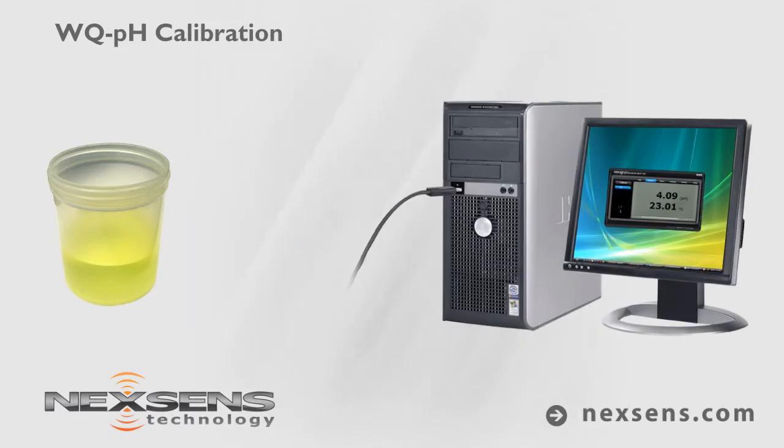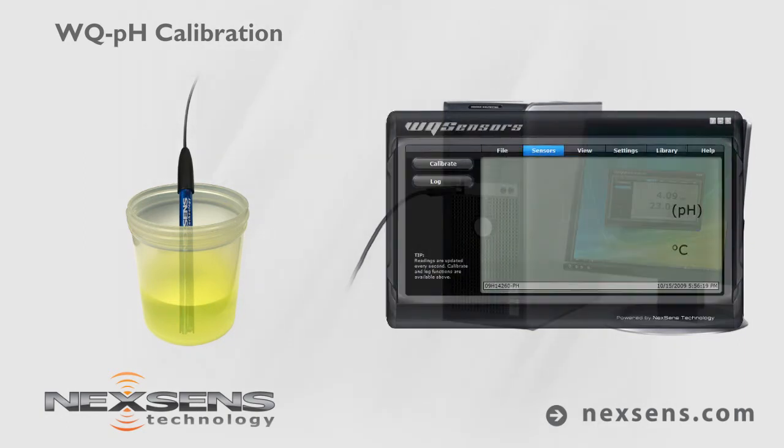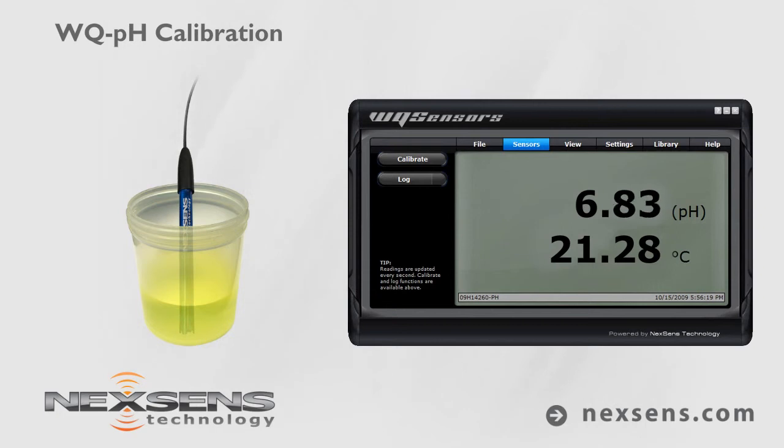With the sensor connected to your computer and the software running, submerge the probe in pH 7 buffer. Allow the reading to stabilize and press the calibrate button. Adjust the value to 7.0 and press enter.